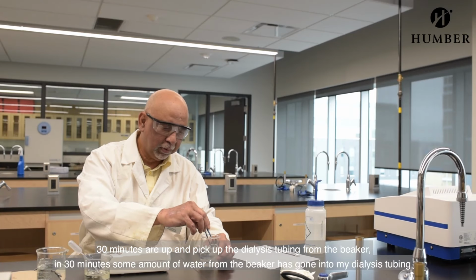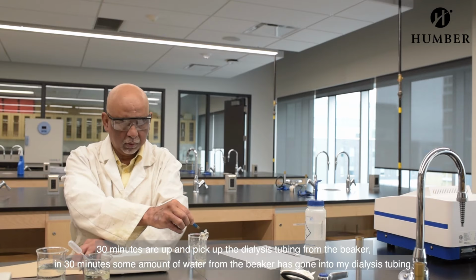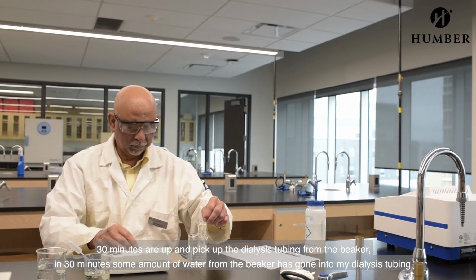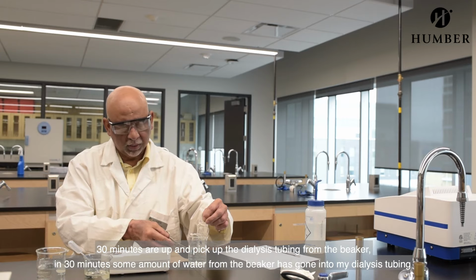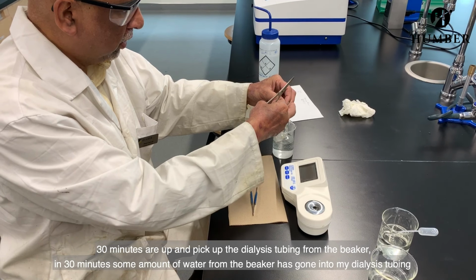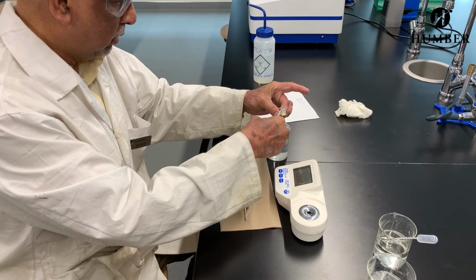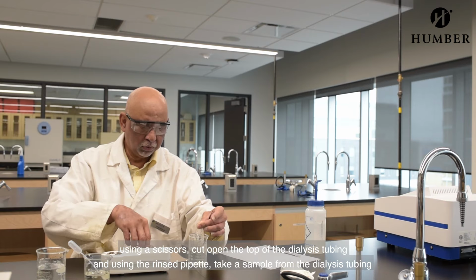30 minutes are just up. I'm going to pick this up. So in 30 minutes, some amount of water from the beaker has gone into my dialysis tubing. It's a movement of water. I'm just going to cut that out.